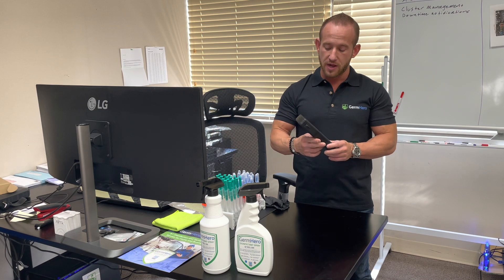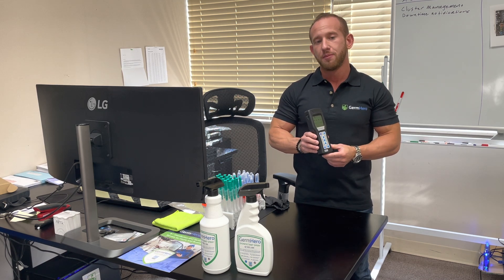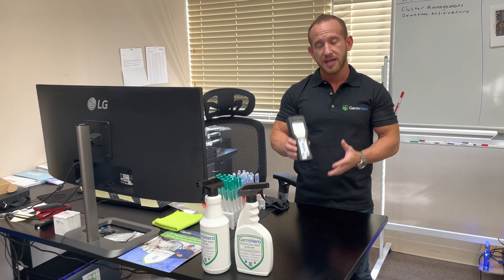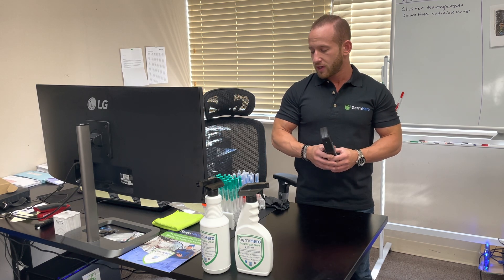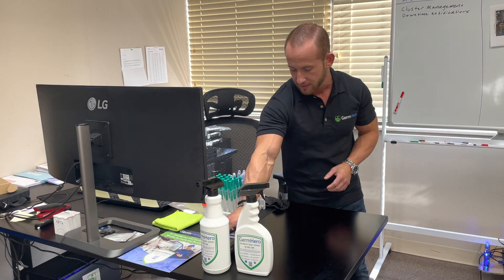It's an industry standard to measure the cleanliness of a facility. Certain facilities like hospitals need to maintain certain RLU measurement levels. The device outputs a number between 0 and 9999, and based on that number you know the level of contamination and cleanliness. A common area in a hospital, for example, needs to be maintained at about a 50.